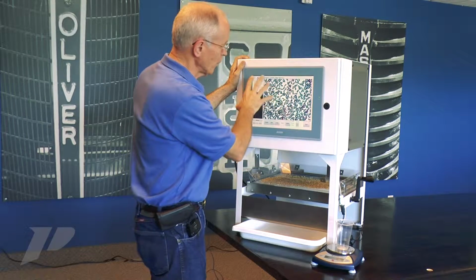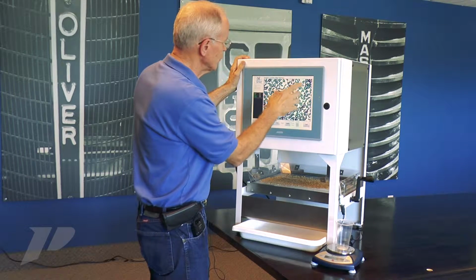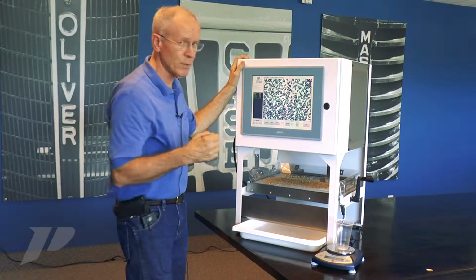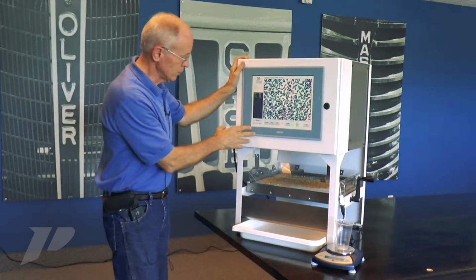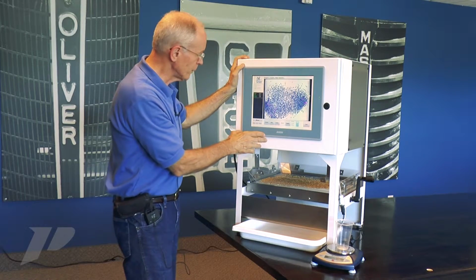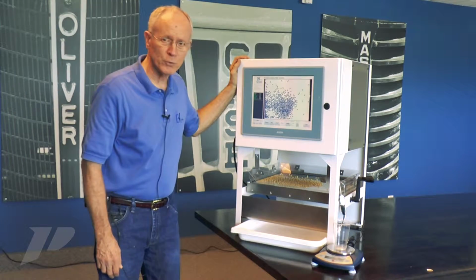I'm looking for the counts to be correct. I see 2, 2, 2. I see all the yellows are 2s, all the reds are 3. I can be confident it's a good count, and then I can go back to reset view, and there's my image.